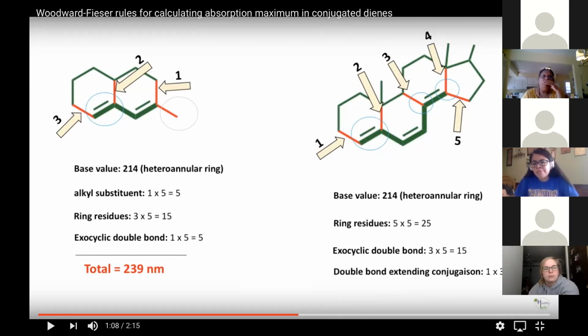So look at the double bonds, they're all in conjugation, right? So the one she circled, but why does she call it an exocyclic double bond? They should be only, I see, no, I thought I had it, but I don't.